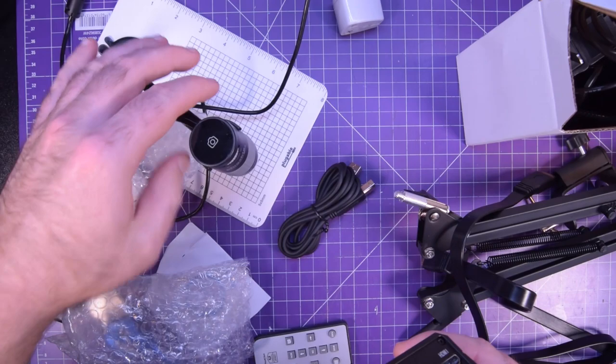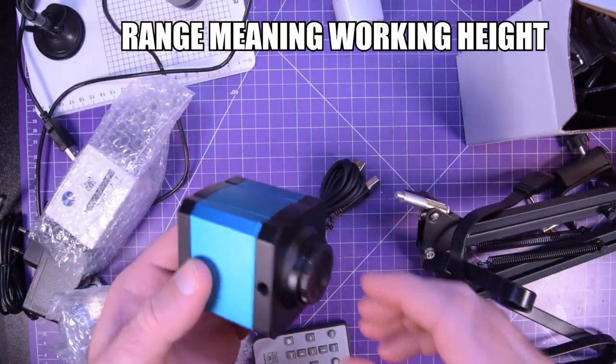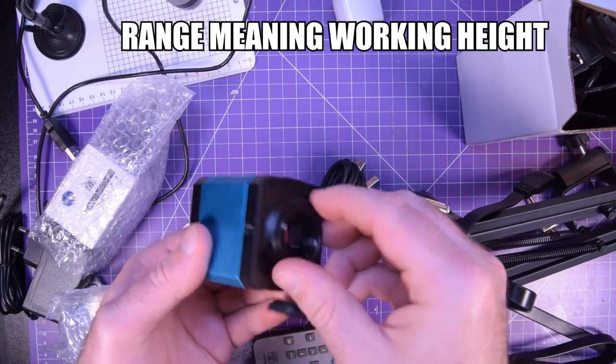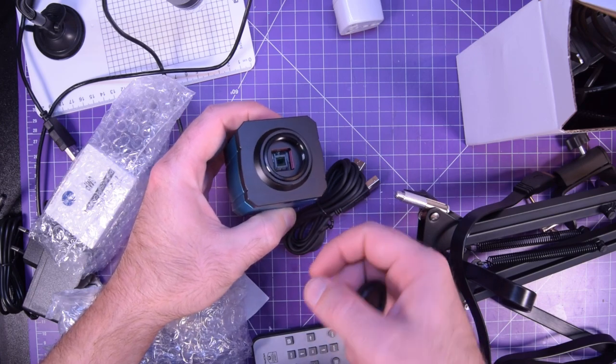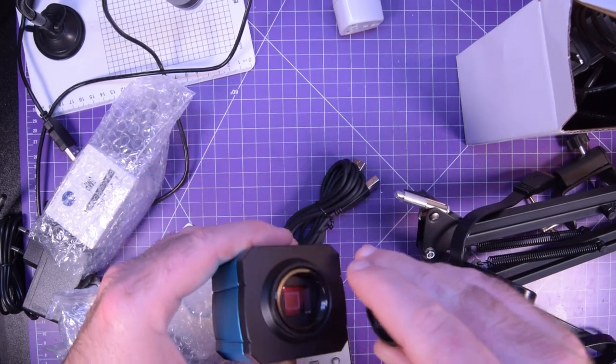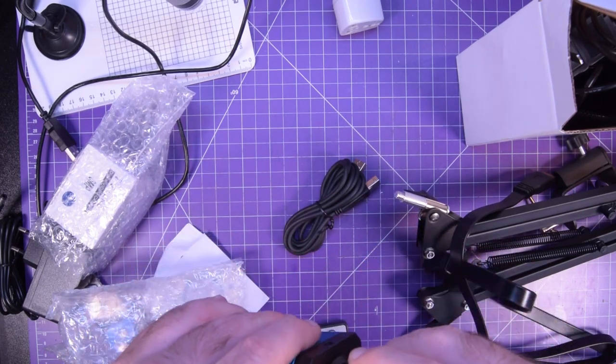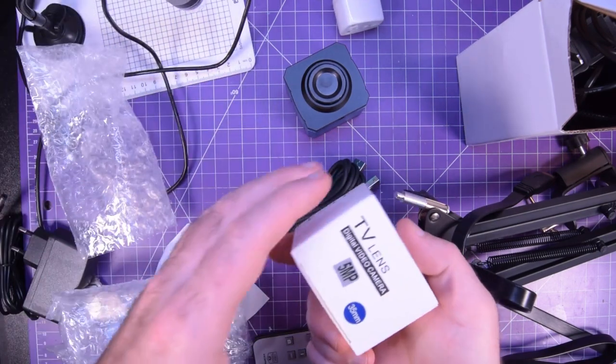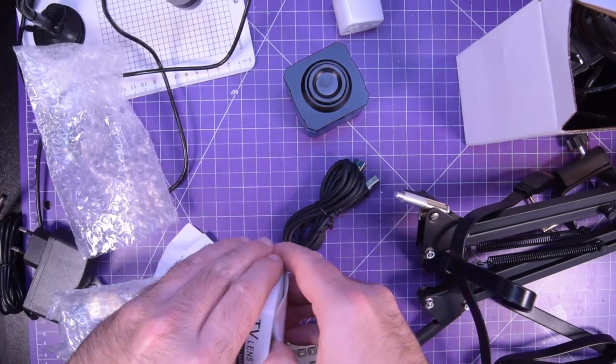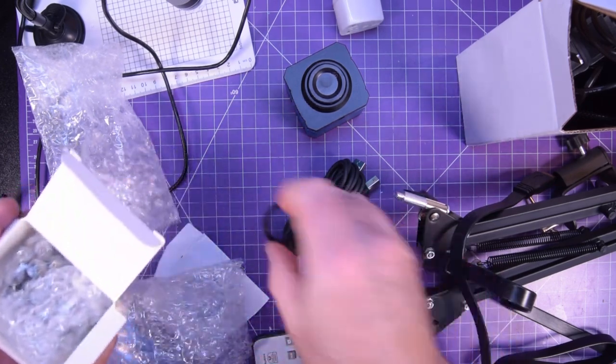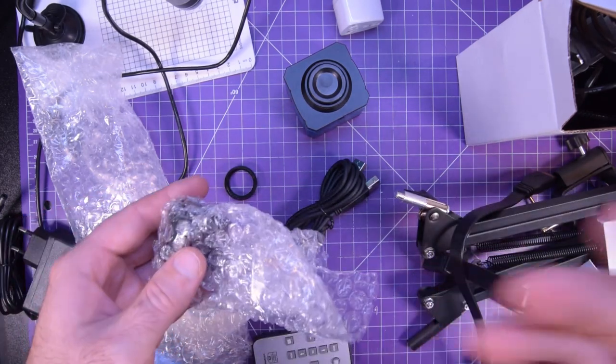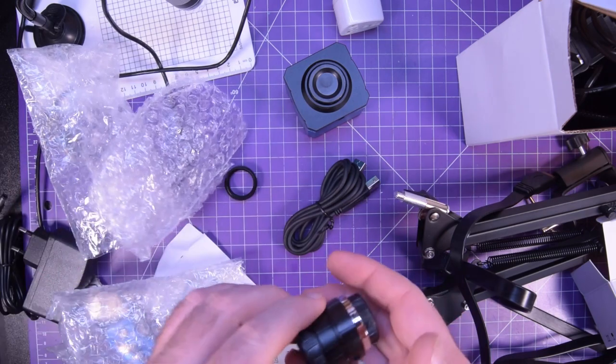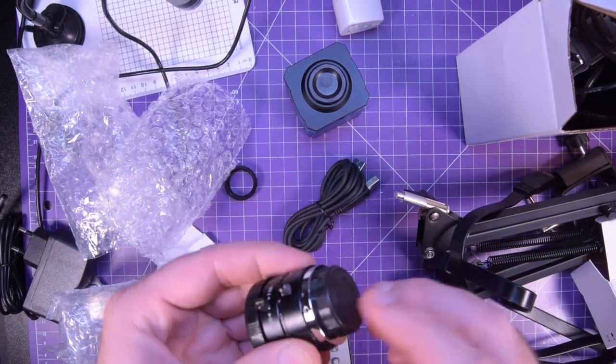This pluggable one here, you don't get a lot of range on high magnification. The second thing is this thing is an interchangeable lens device. So there is the sensor element there. And this uses I think it's M43, Micro Four Thirds lens system, which is what is in here. So this is a specific lens to use this as, well, they say it's a microscope, but I'm not sure.